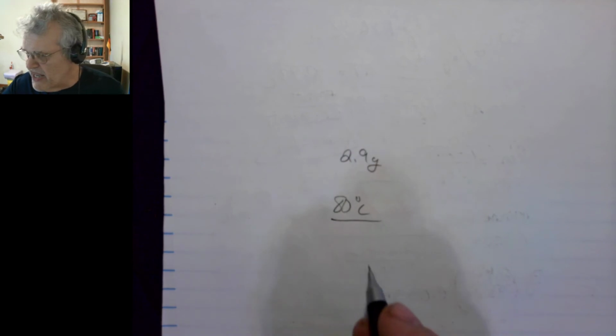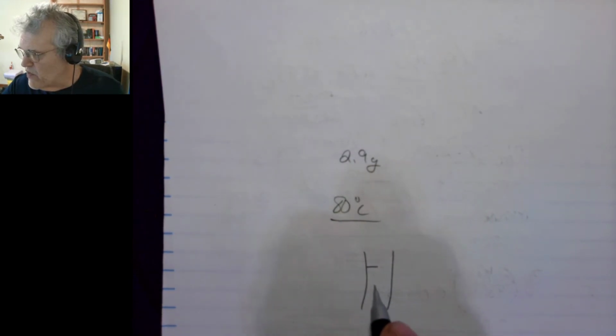If your thermometer has divisions on it that are every tenth of a degree, right? If this is like 80 degrees here, 80.0, if this was 81.0, then you want to make sure that you look at that thing and try to estimate it to a tenth of a division.